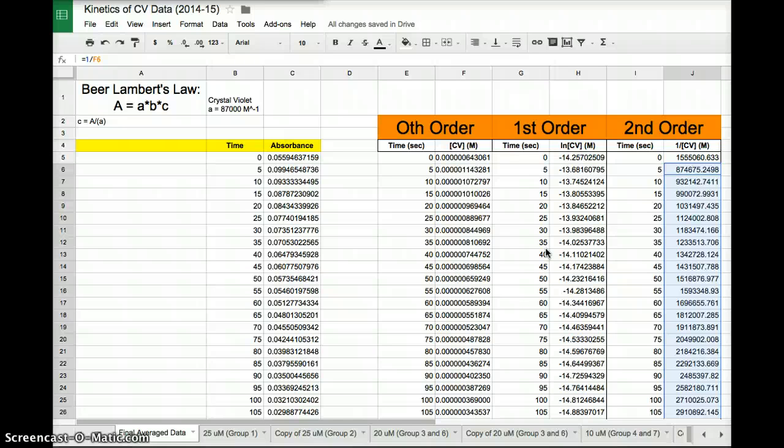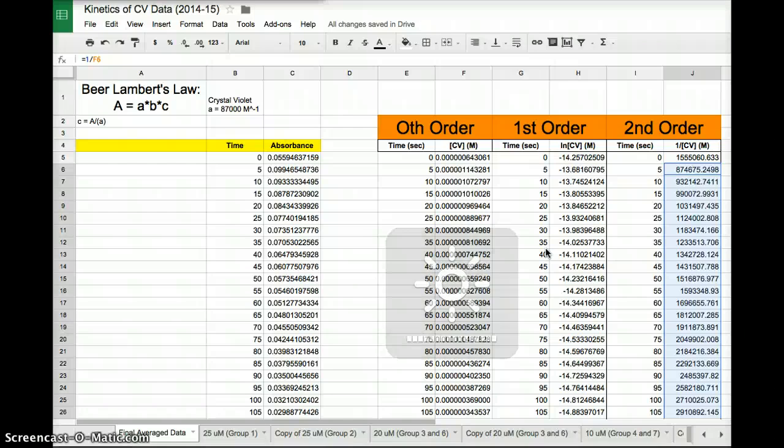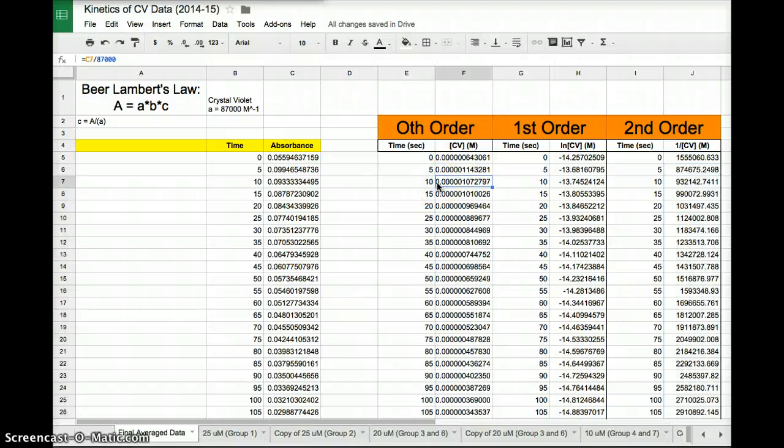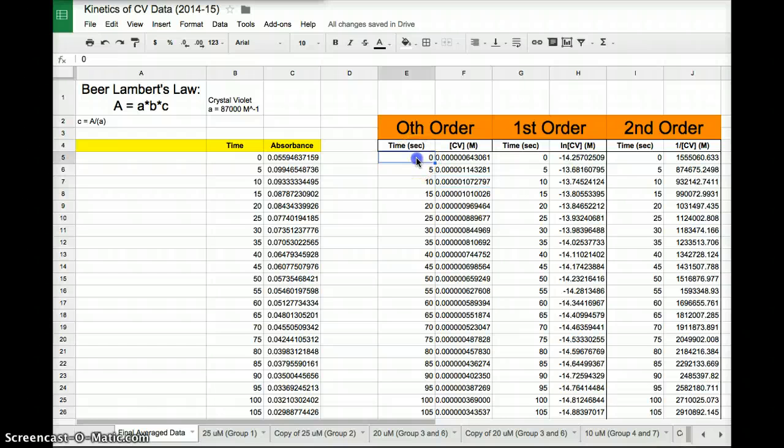That's part 1 of the lab, of the analysis here. The second part is we actually need to create the graphs. So how do I do that? In order to create a chart in a Google spreadsheet, it's very similar to Microsoft Excel. What you want to do is highlight the data that you want to create a graph of, that you want to plot.